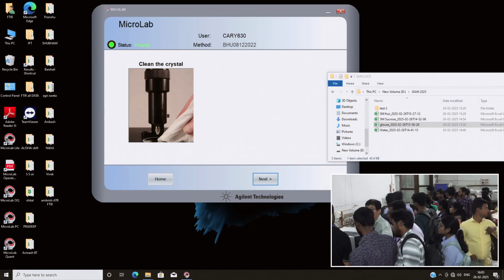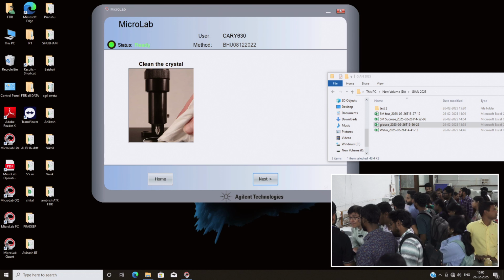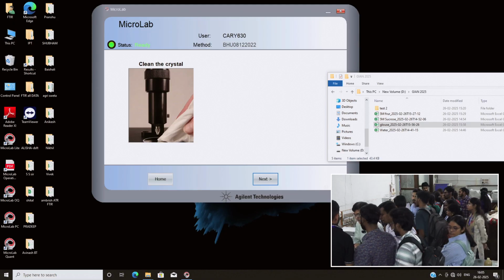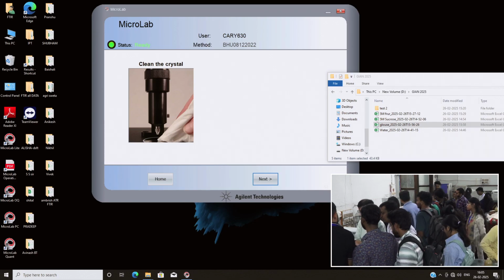I will work on surface enhanced infrared absorption spectroscopy, enhancing the vibration of molecules using FTIR. Surface plasmon resonance? Surface-enhanced infrared absorption is similar, but quite different.